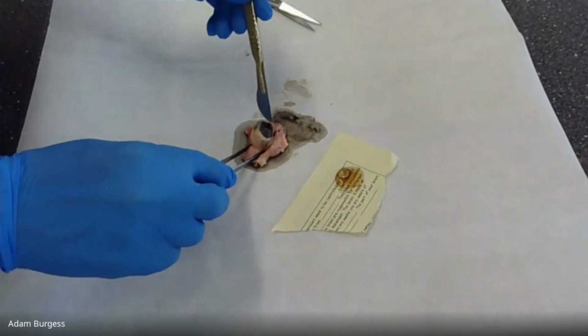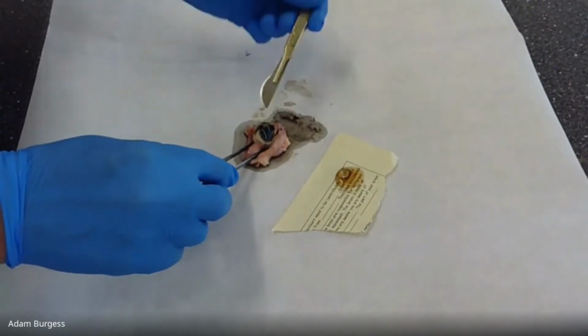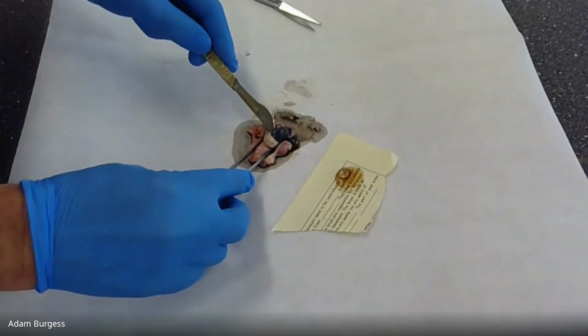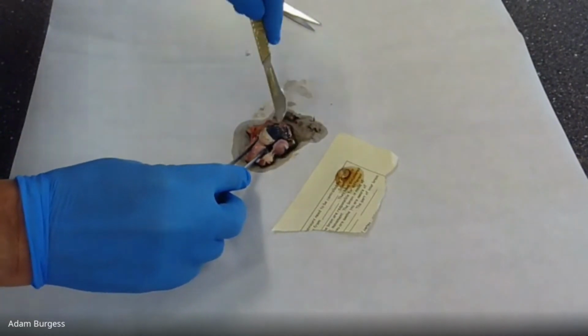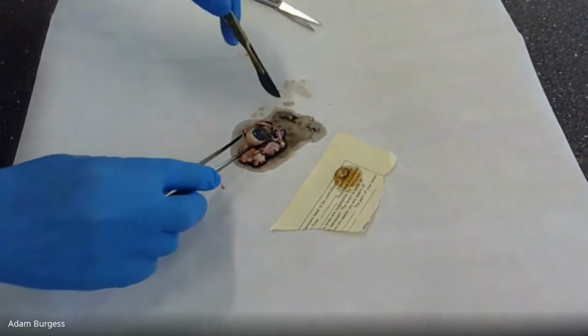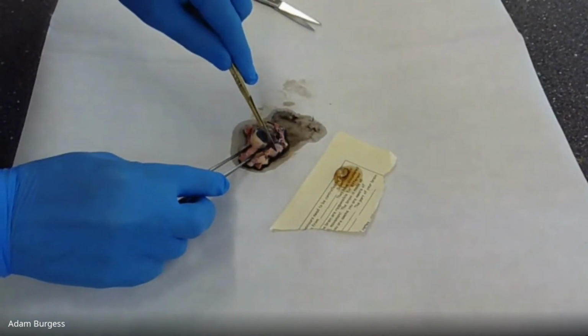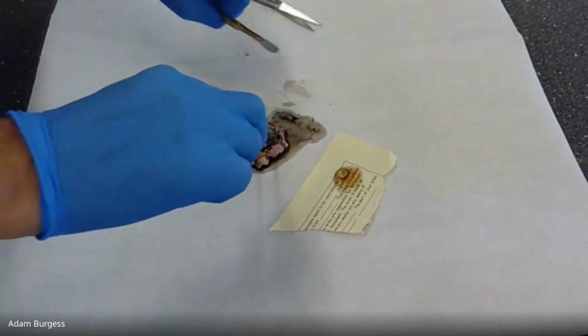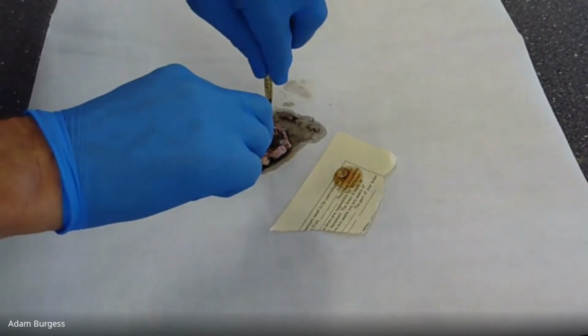And then what you want to do is cut around the sclera, that would be great. But you can see there's lots of black liquid. You're going to be doing this in a tray, and I'd like you to make an incision and then open. I'm not going to do it now, but oh, why not?